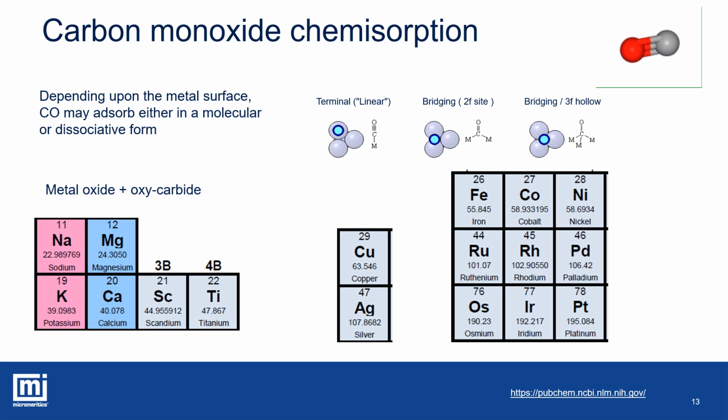As the stoichiometry with carbon monoxide is uncertain for several metals, sometimes it is not reasonable comparing metal dispersion results obtained by carbon monoxide chemisorption with other gases having a known stoichiometry, like for instance hydrogen.